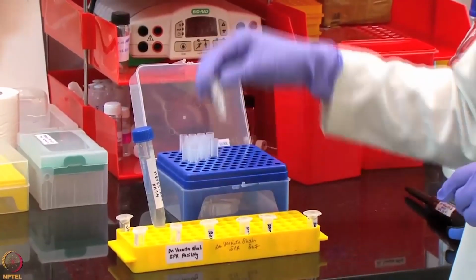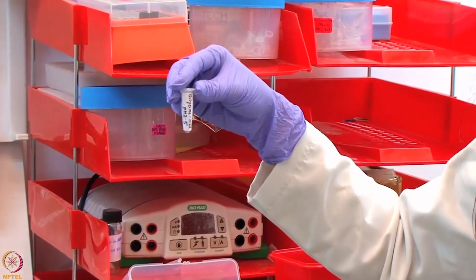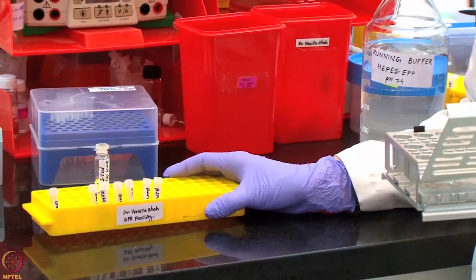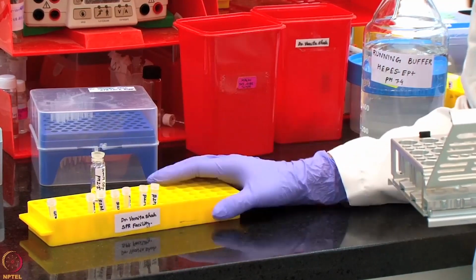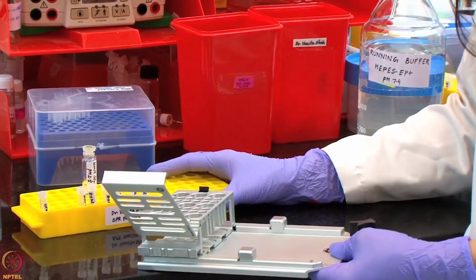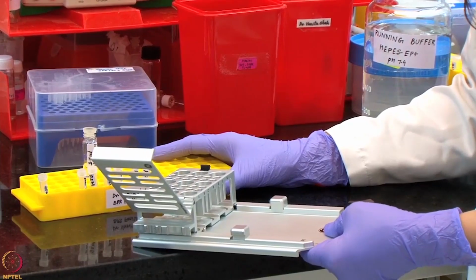For regeneration, we will be using glycine HCl pH 2.5 as the regeneration solution. All these samples and reagents have been transferred in the required volumes in these specialized tubes and will now be inserted in the appropriate rack and then into the system for the kinetic interaction analysis.